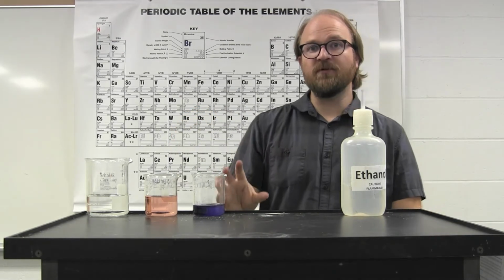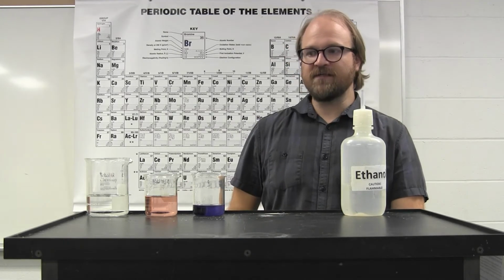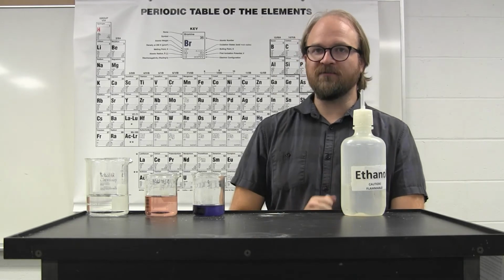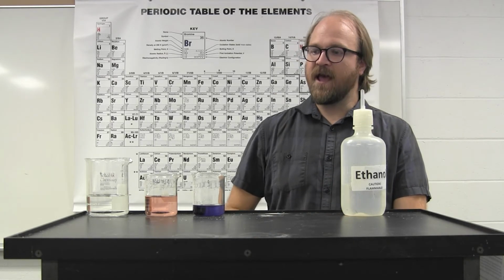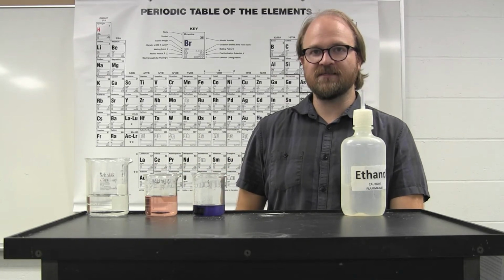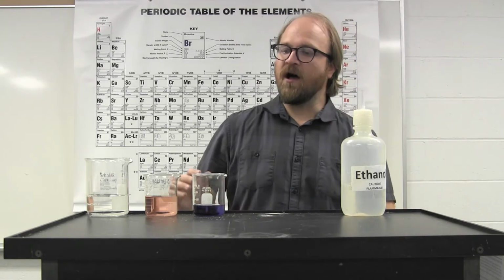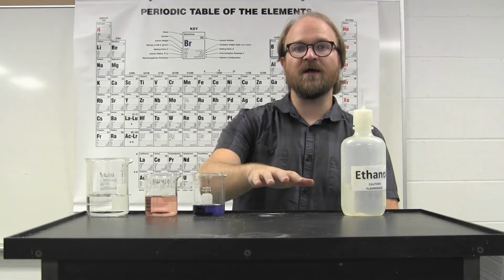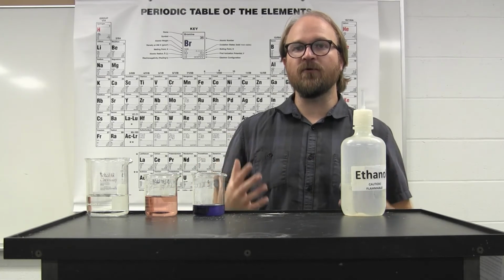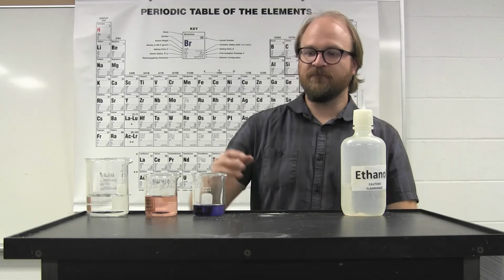It's this purple solution that would have the color characteristics of both the pure blue cobalt tetrachloride complex and the red cobalt hexaaquo complex. If you were to take an absorbance spectrum of either of the pure compounds, you would only see one peak, one primary wavelength of color that absorbs the most.